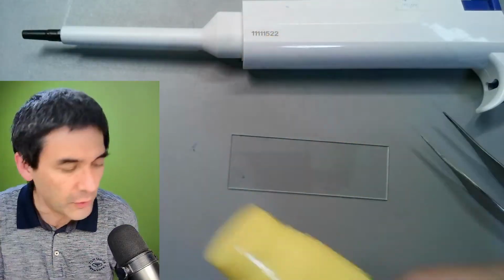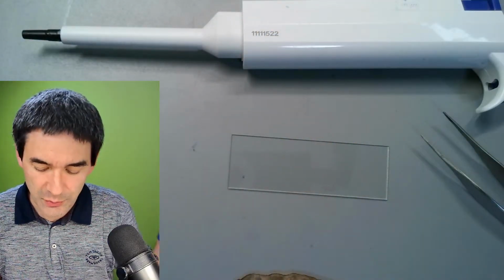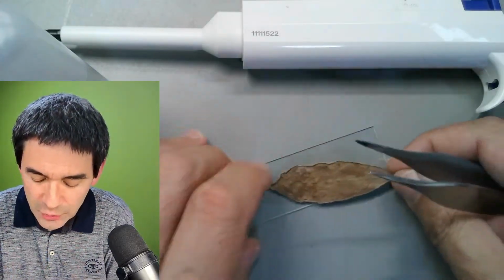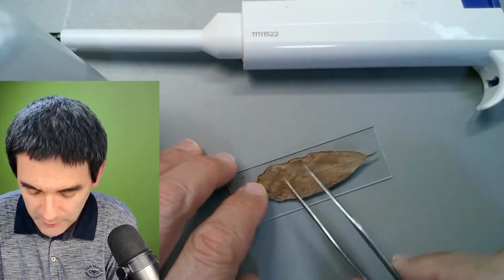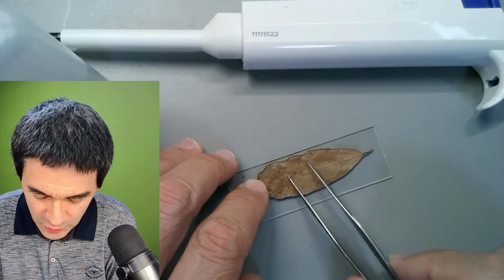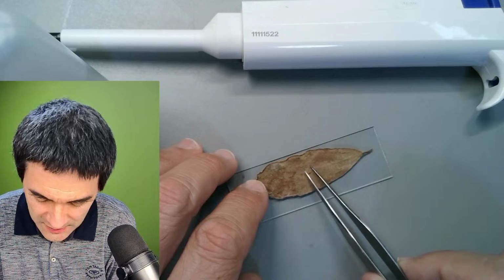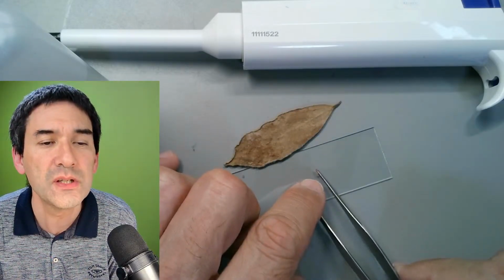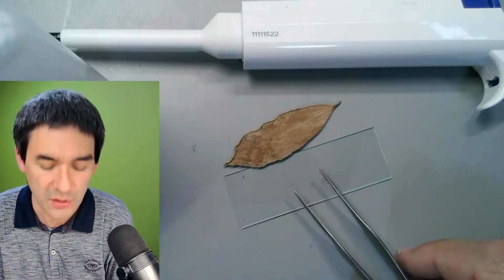And I've also had reasonably good results with those, right? So the first thing that we have to do, if we want to collect the trichomes here, is collect them from the surface. One way of doing that is carefully trying to scratch the surface. Then there is this fuzzy thing that you might see, which is a little bit difficult to see, and these are the trichomes.